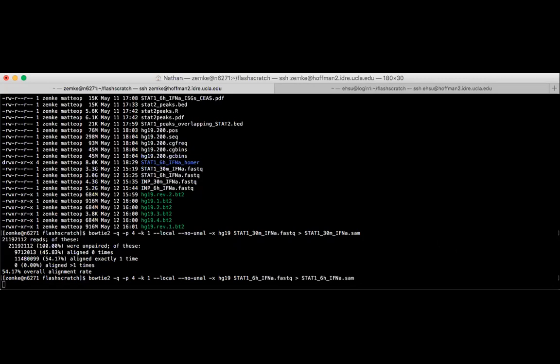If people are having trouble, weren't able to get the alignment done, and need to stop doing this, I can have the SAM files available to download, so you can continue tomorrow, because we're going to require the SAM files for our downstream programs. Let me know if you need me to make these files available to you.